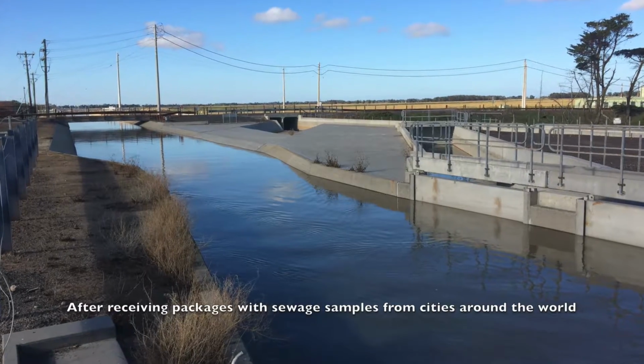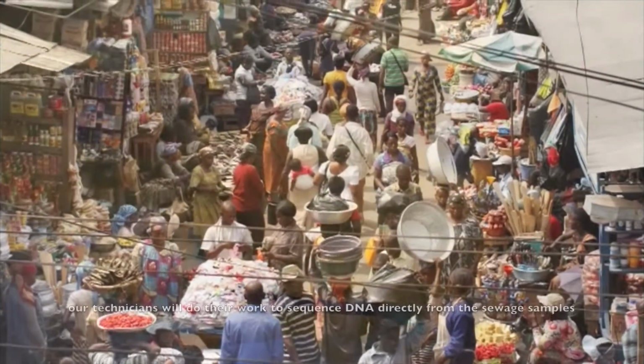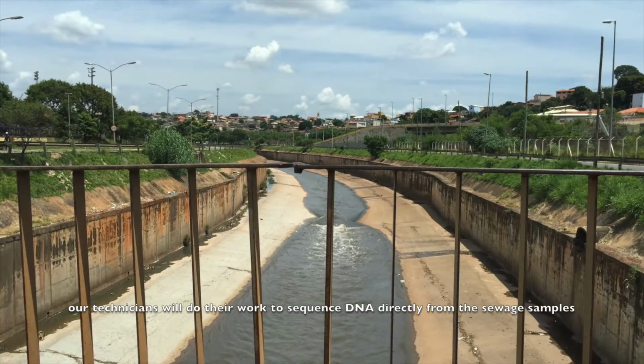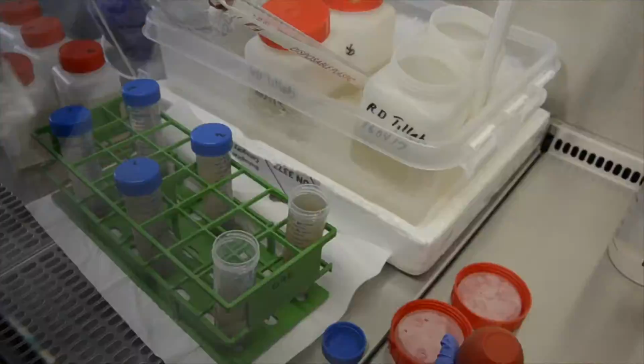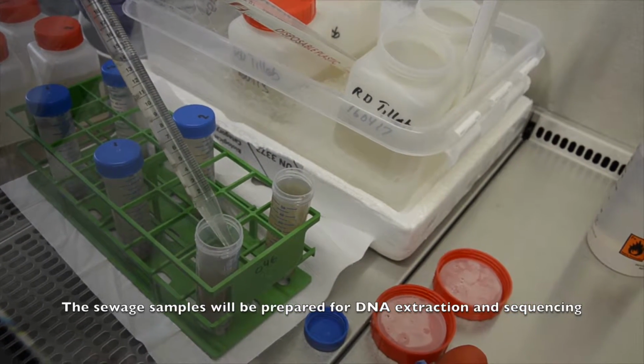After receiving packages with sewage samples from cities around the world, our technicians will do their work to sequence DNA directly from the sewage samples. We unpack the packages, and there's supposed to be 2 samples from different dates, 1 liter each. The sewage samples will be prepared for DNA extraction and sequencing.